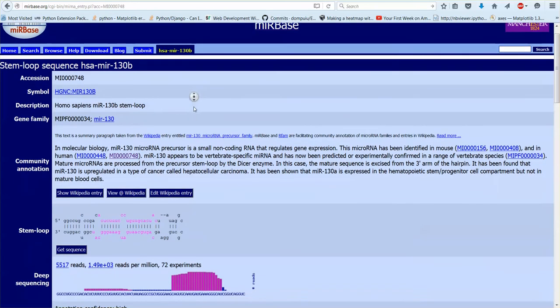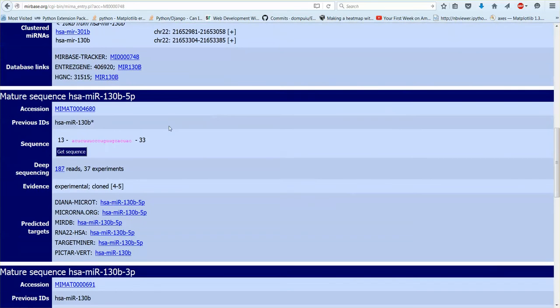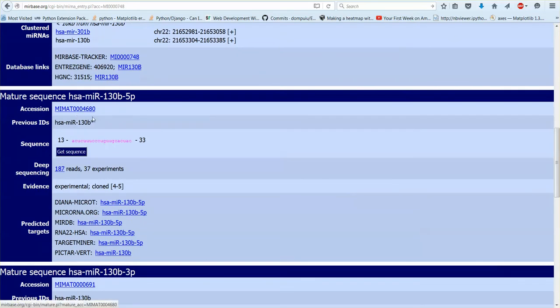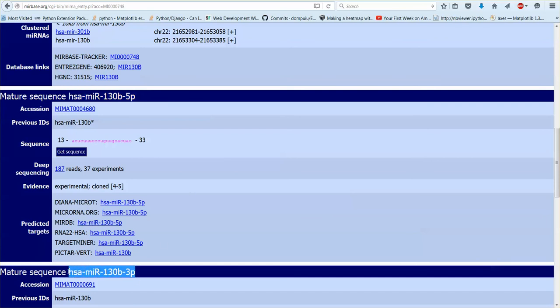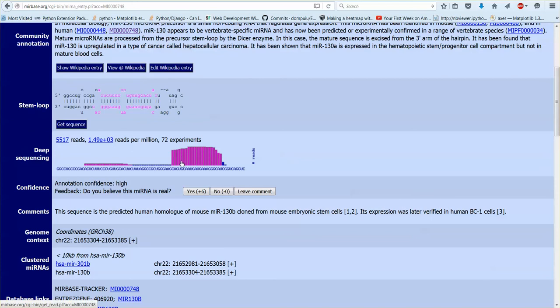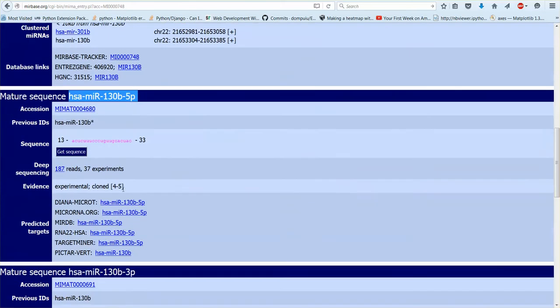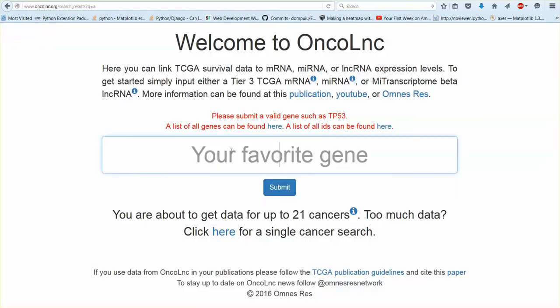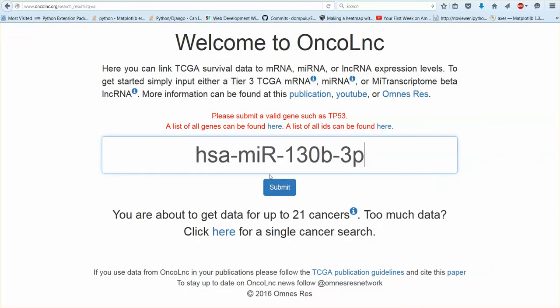The stem loop is what TCGA has in their annotation files but I went through and using the accession numbers and genomic coordinates I updated the names. So Oncolink only accepts this name or this name. It has to be the mature name or it has to be the accession number. As you can see the 3p is much more highly expressed than the 5p. So let's go ahead and we can take a look at that.